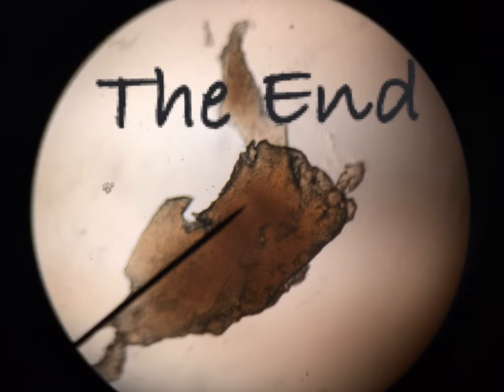Alright, so now we're at the end of our presentation. I hope you liked it, Dr. Gould. In this slide, we tried to get a microscopic picture of the difference between white and gray matter, but I guess the sample we took had more gray matter than white. So along the edges right here, you can actually see the white matter, and then near the middle right here is the gray matter. It kind of ripped off as we were putting it on, but this is the best picture we had.